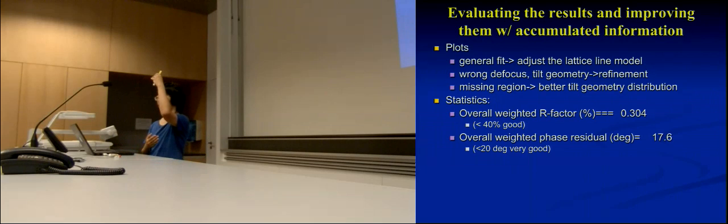When you look at the list of the merged data, some of them have wrong defocus at a certain diffraction spot. Then you have phase, and some of them are going to get flipped. So 180 degrees is a really big value to be different from the original. If you do a lattice line fitting, you're going to see that particular point jump out from everything else.